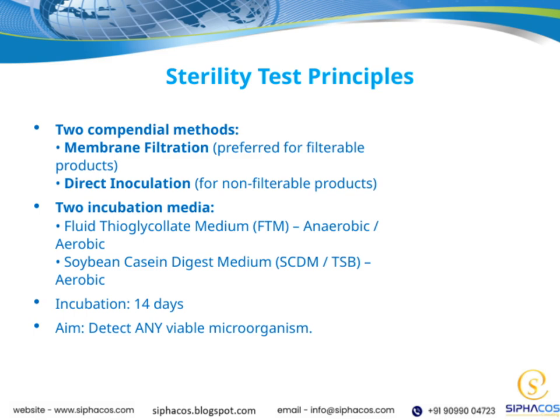The incubation period for these tests is generally 14 days. This duration ensures we have enough time to detect any viable microorganisms that might be present. The overall aim of this process is to detect any viable microorganism, no matter how small or slow-growing, to confirm the sterility of the product. In summary, these principles form the backbone of sterility testing, helping us ensure that the products are free from microbial contamination before they reach the end user.